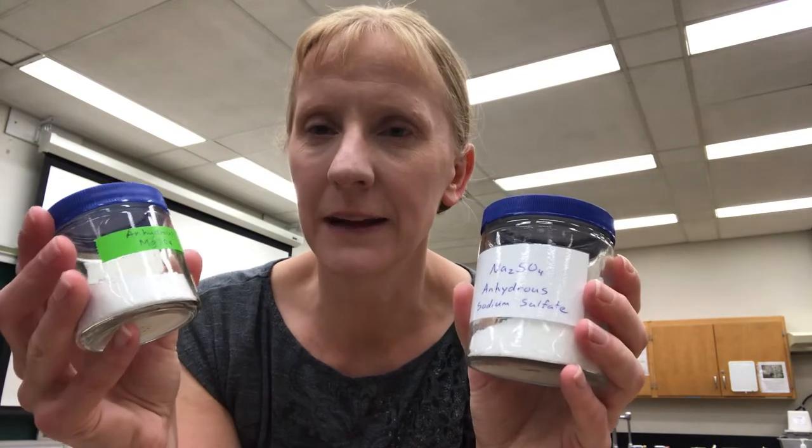Hi, I'm Lisa Nichols and in this video I'm going to show you how to use two different drying agents, sodium sulfate and magnesium sulfate, to remove water from an organic solution.